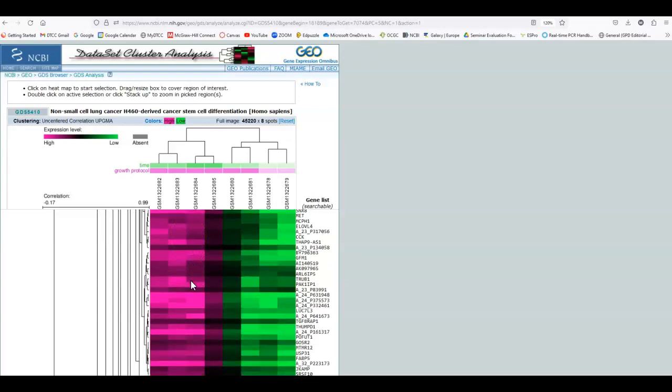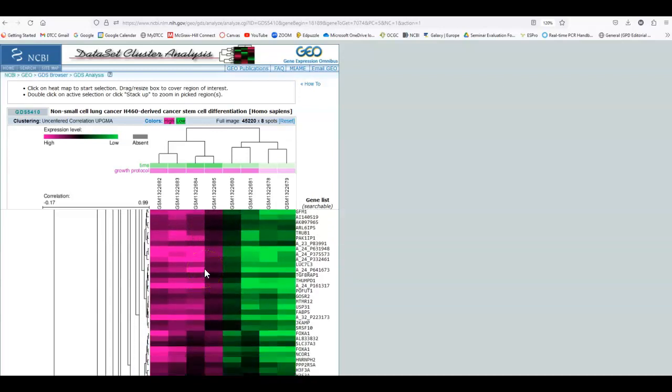But this would be really interesting if I was a scientist, if I wanted a bioinformaticist like you to compare these and tell me what things are of relative difference. And it would be very interesting to see what these samples are and why they differ the way that they do. And again, this could be something where these are controls and these are patients, but this doesn't really say what that is, and that's fine. But the point of this is to teach you an extension of the DNA microarray and to show you how we use that data and can interpret relative gene expression.